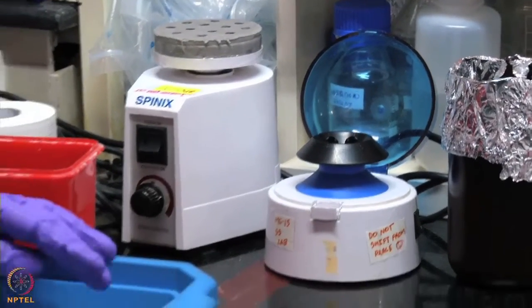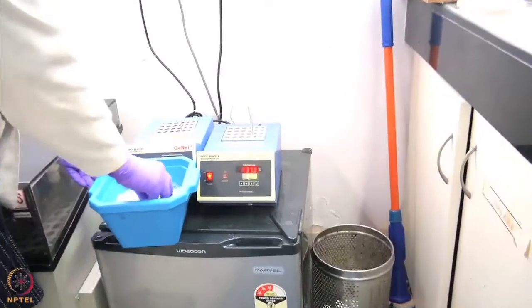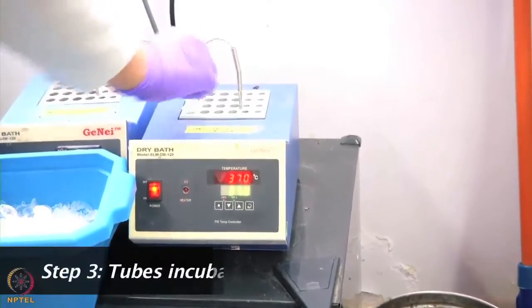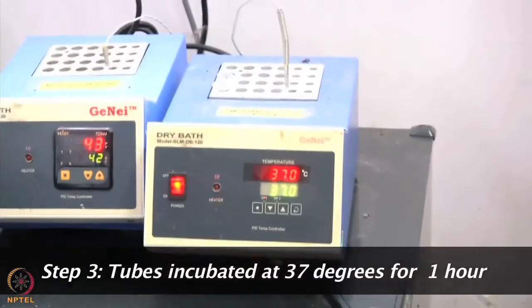Now we will incubate the tubes at 37 degrees. The incubation will be done for 1 hour.